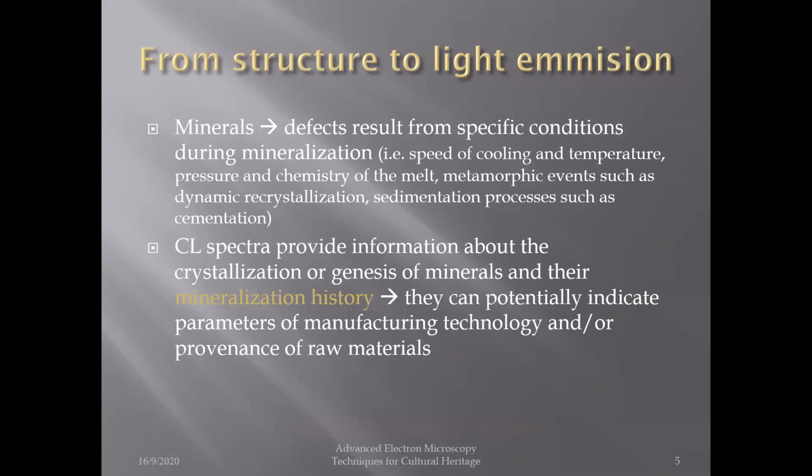Each of these point defects will create a different kind of change in the crystal structure, which in turn will result in a different CL spectrum being formed. So in very simple terms, if we study the CL spectra, then we can have information on the history and the mineralization history of our sample.